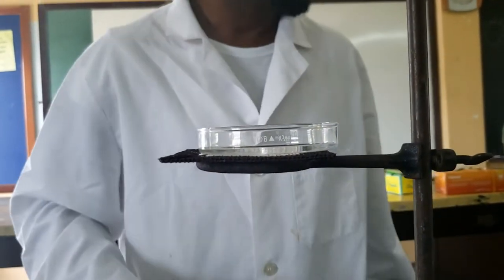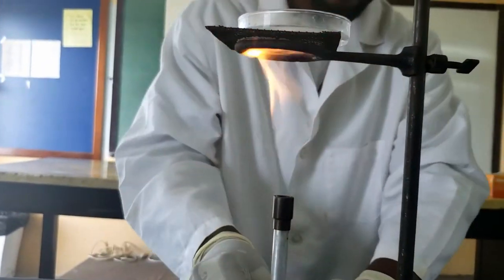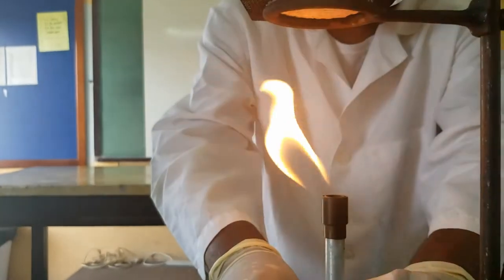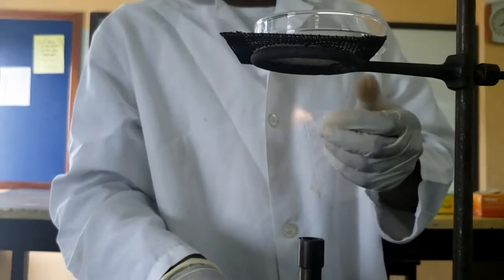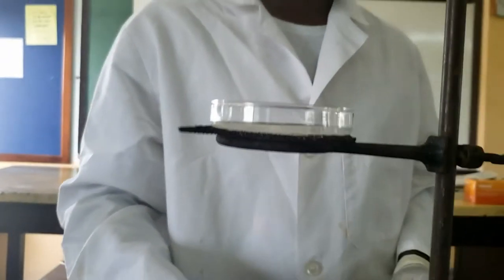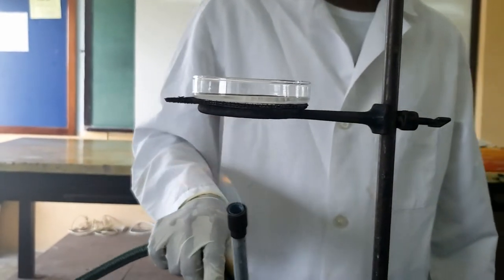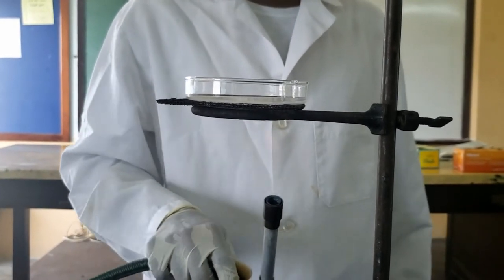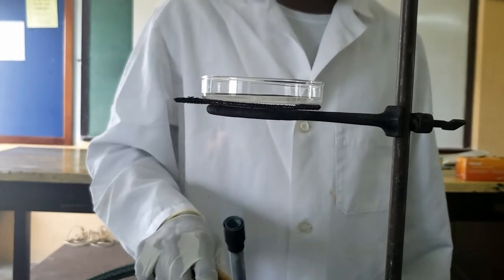We are going to lower our flame first, open the oxygen intake, make sure the setup doesn't fall, and we're just going to move the flame around below to evaporate the solution.